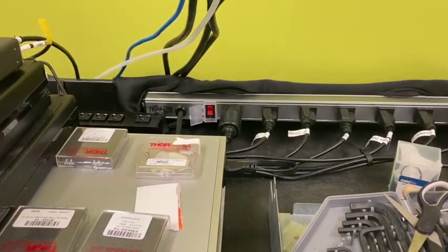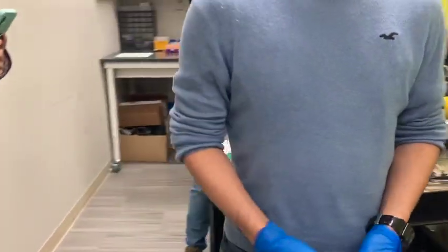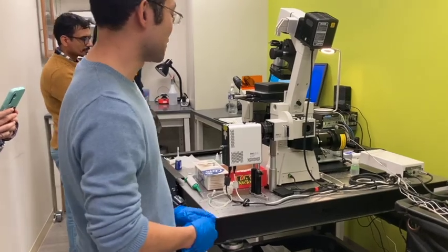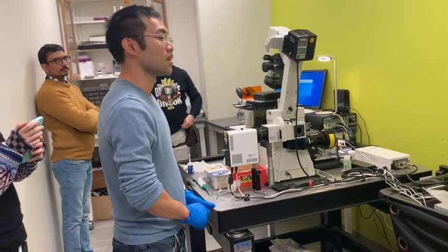The main power is a kind of safety protection in case you forgot to turn off something. So this is going to help turn everything off.